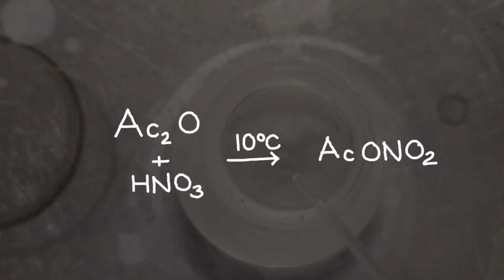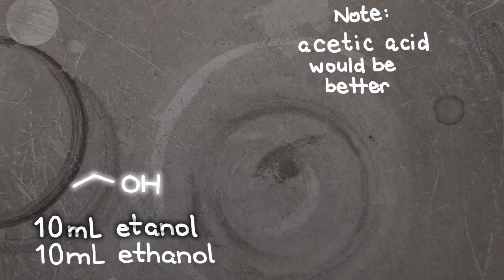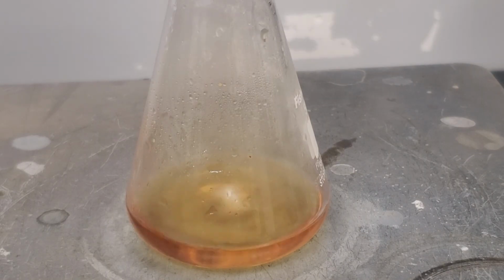To this stirred solution, I added a cold solution of vanillin dissolved in 10 ml of ethanol, also dropwise. As you can see here, the addition was too quick. The mixture got hot, turned very dark, and gave off some brown nitrogen oxide fumes.